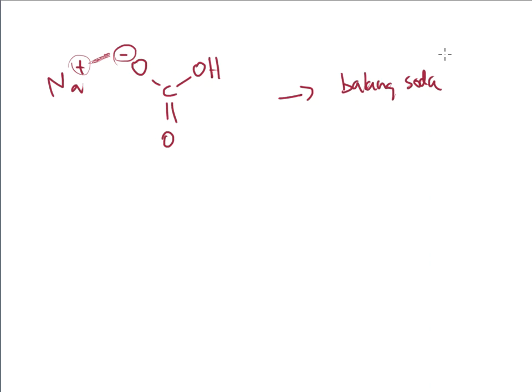And that's really all that we have in the laboratory too. We have a very purified version of baking soda that we are putting onto the instrument, and that baking soda is releasing my HCO3 group, and that is allowing some of these charges to separate on the inside of the ion chromatography instrument. The next one was Na2CO3.